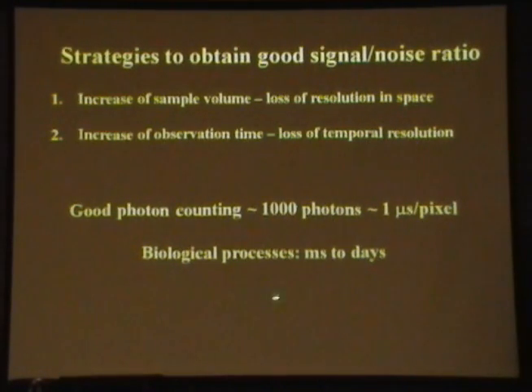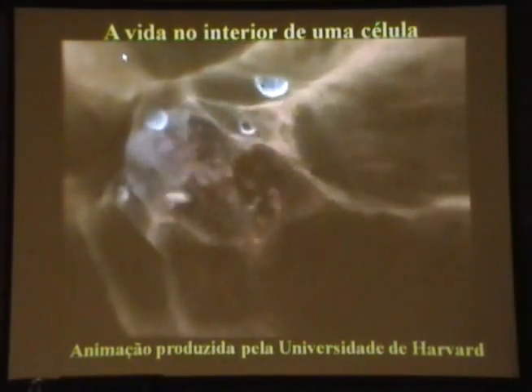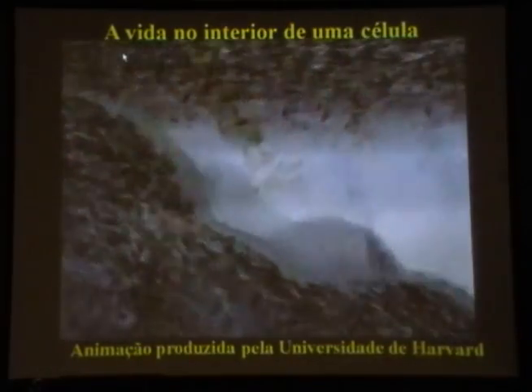And the biological processes usually last from milliseconds to days. So sometimes you need to take time-lapse images for 20 days or 10 days to follow some cell process, and that's important. I show you here a movie, an animation made by Harvard University showing the inner life of a cell. You just have to listen a little bit about this here.